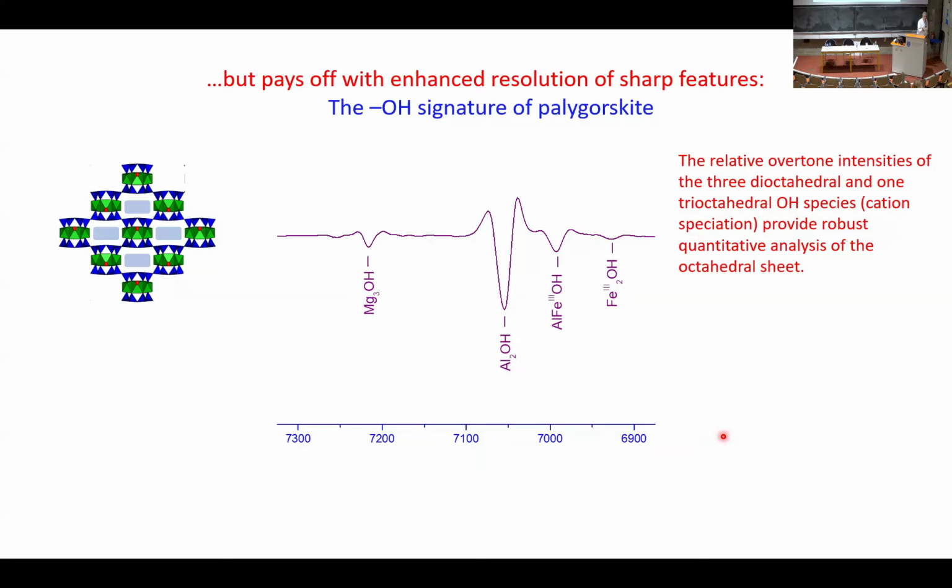It's a 2-to-1 zero charge mineral, but the 2-to-1 layer is discontinuous. It looks like that. And the cavities that you see are essentially tunnels, because the whole thing makes a lath, like a fiber. Toshi had a beautiful SEM picture of sepiolite, which is the first cousin of this palygorskite that you see here. So this is a beautiful example of a very complex internal surface. There are tunnels, channels, edges, in addition to physisorbed water.